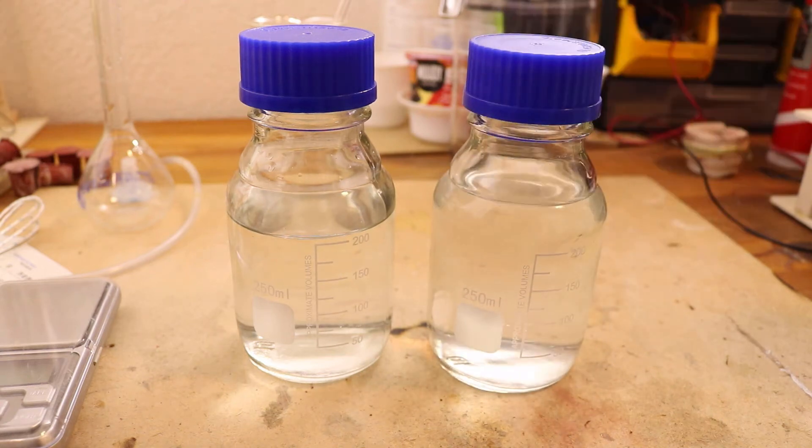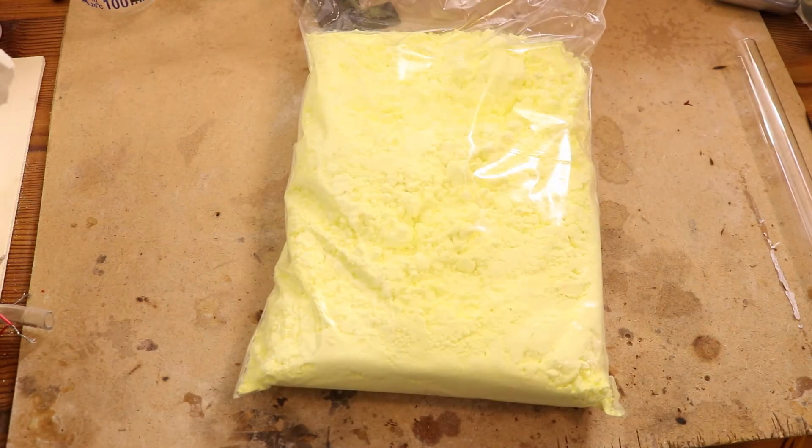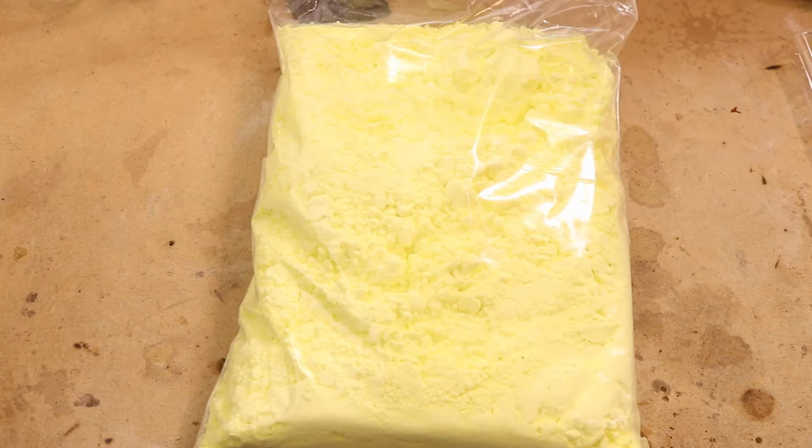Hello and welcome to ScienceFury. In this video I will show you how to make sulfuric acid. First we need the most important ingredient and that is sulfur. I directly ordered 1 kg — I actually have no idea what to do with so much, so if you have any ideas write it in the comments.